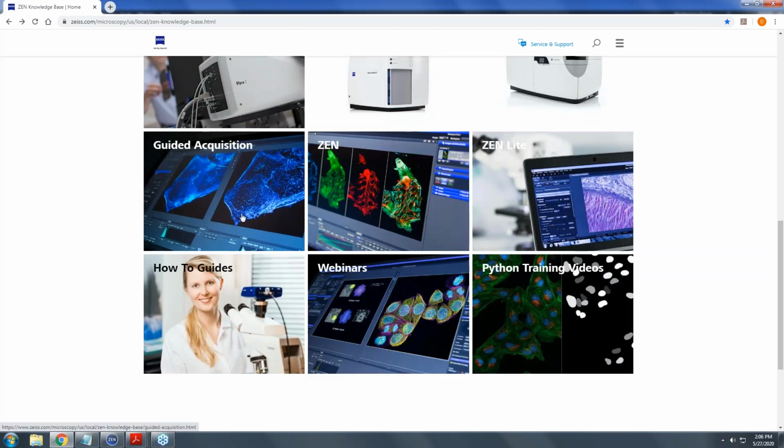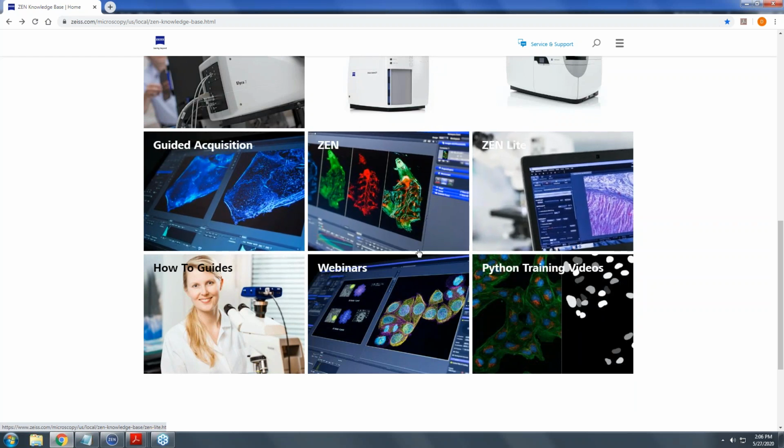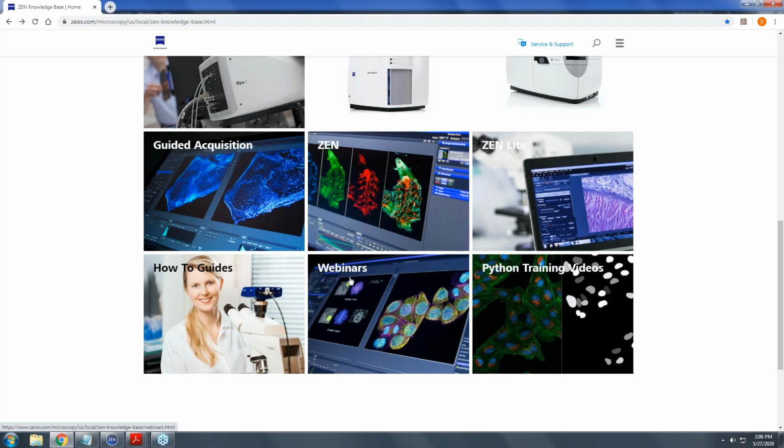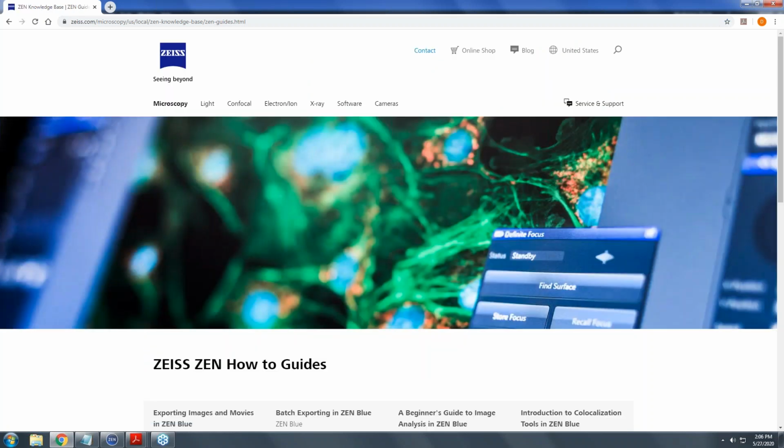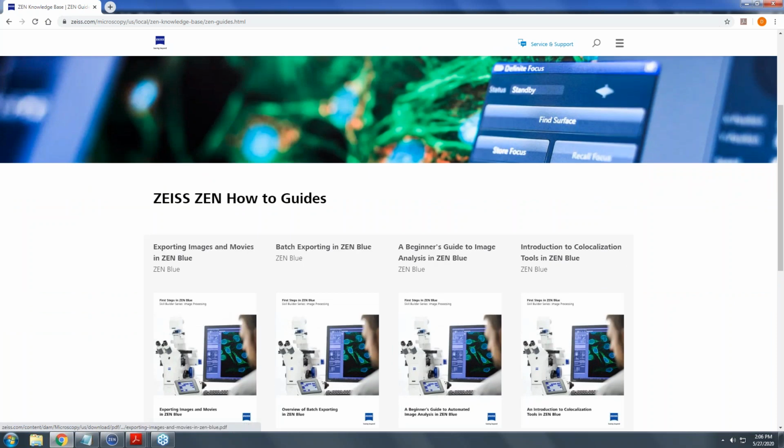Here you'll see different categories, so stuff on Zen, different webinars that we've run, if you'd like to go and rewatch some of those, how-to guides as well. So very helpful and all in one place. So feel free to browse this area, and I think it'll be really helpful for you getting to know Zen and just getting comfortable with it and not feeling like you're scratching your head for something, let's say, super simple, like exporting a movie. So yeah, it's just Google Zen knowledge base and it'll take you right there.